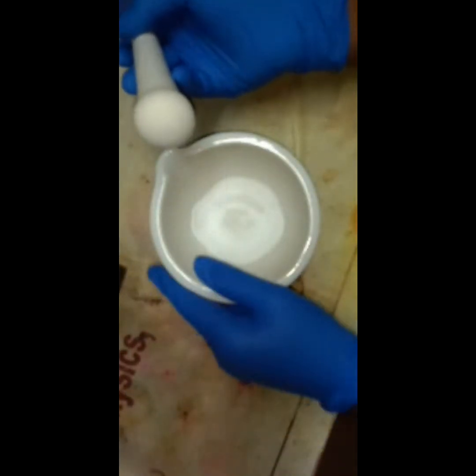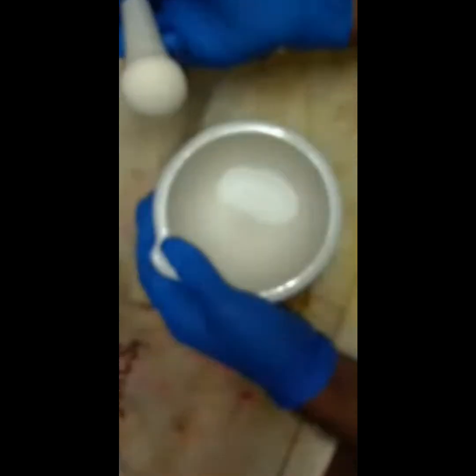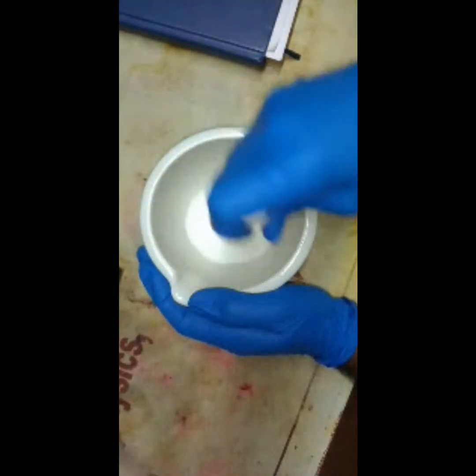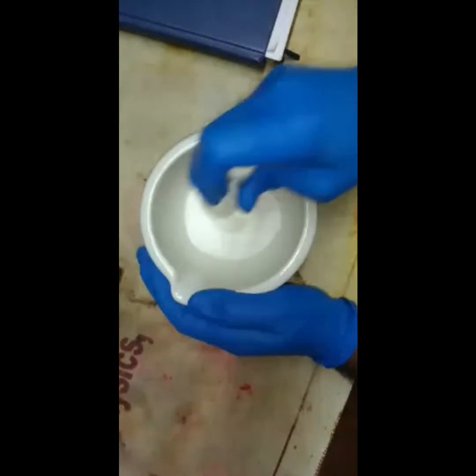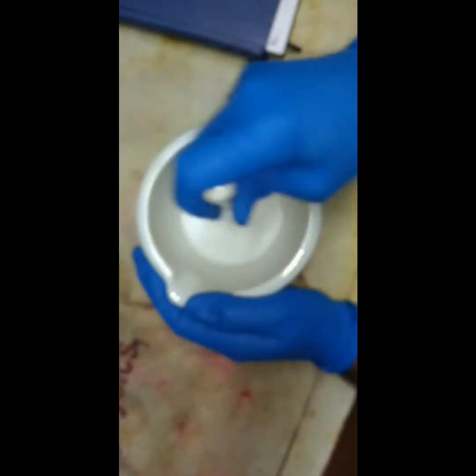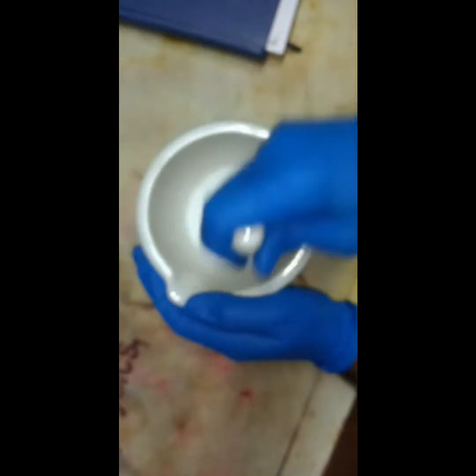The particles are not yet at the nano scale of 10 to the power minus 9 particle size, but you can grind the sample well. First, approach preparing the sample with the sol-gel method.